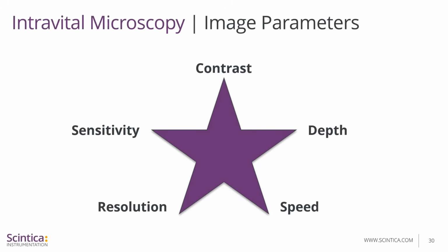But keep in mind that in general, imaging is all about trade-offs. You will always have to balance these parameters against each other. So it's important that you figure out what is the most necessary parameter for you to be able to perform successful analysis of your images. Overall, your goal should be to obtain an image with a good enough contrast for analysis, without any saturated pixels, with minimal bleaching, and with overall settings that you can reuse over different imaging time points and between different imaging subjects so that you can objectively compare the images that you've acquired against each other.